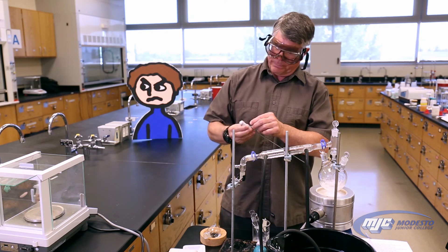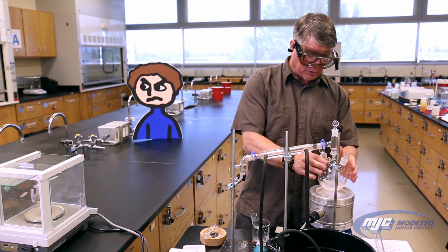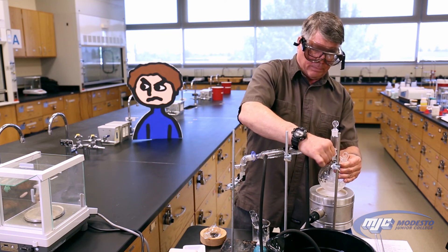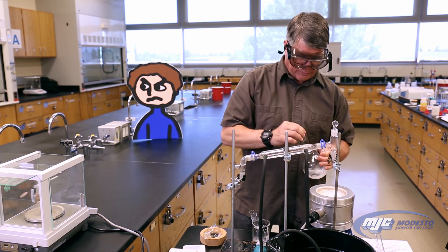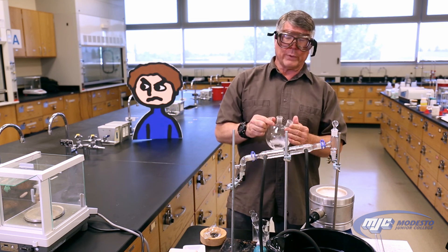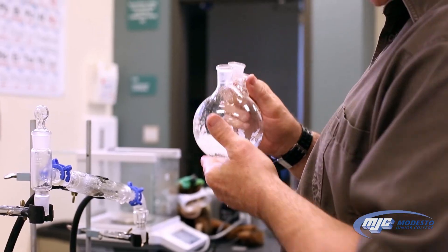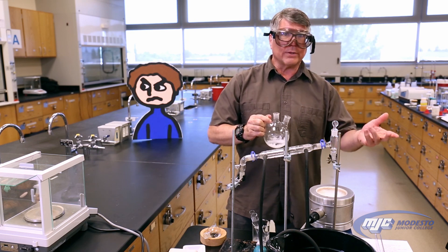Now what we do is we're going to take the distillation flask — the evaporating flask — which should be cool enough now, unclamp it, and take the stoppers out. Now we put this in the oven and we're going to let it dry until next week. When we come back, we'll weigh the flask with the salt in it and that'll be our A8. That's all there is to it.